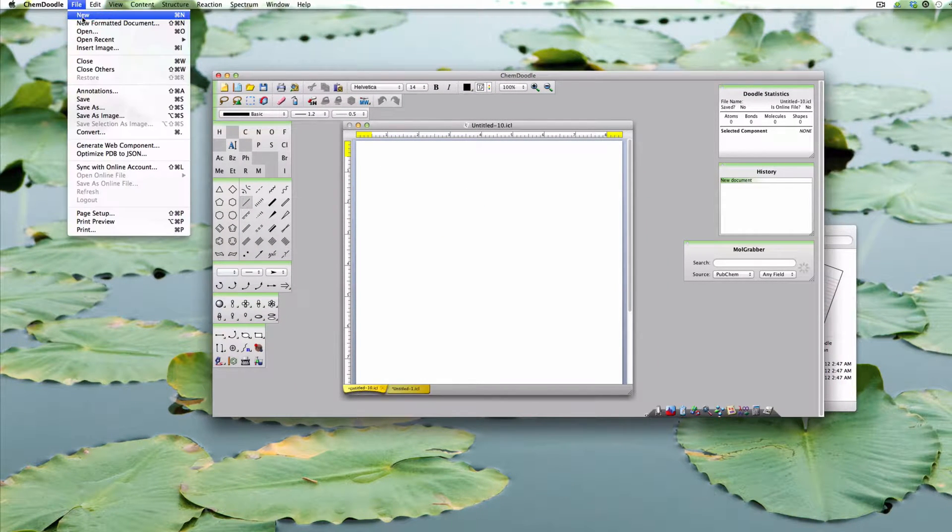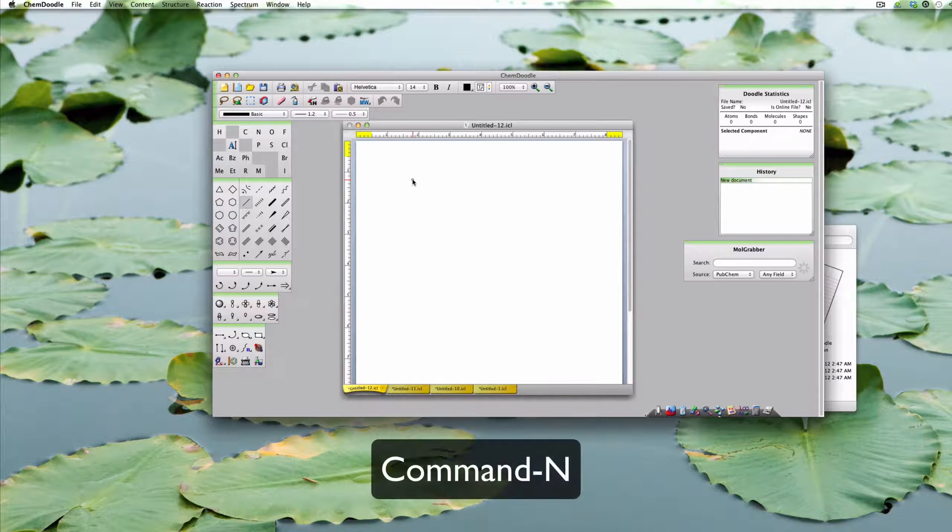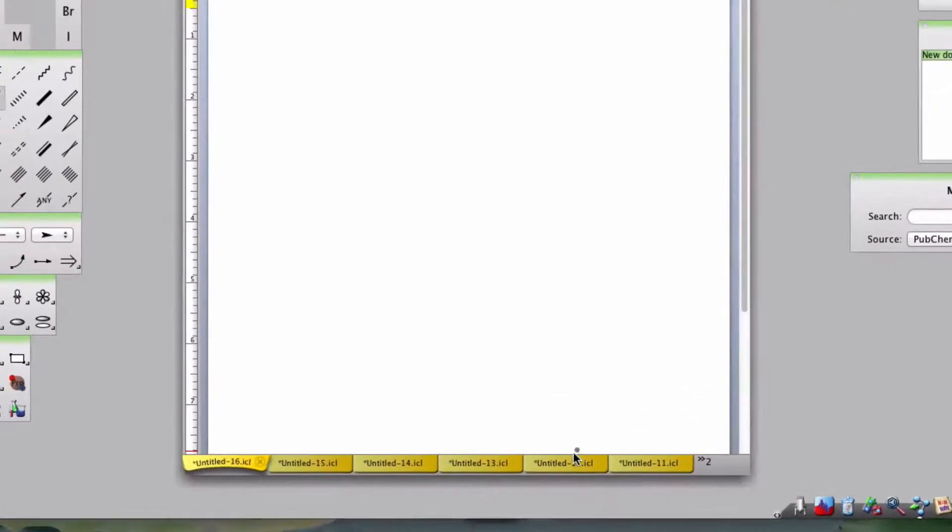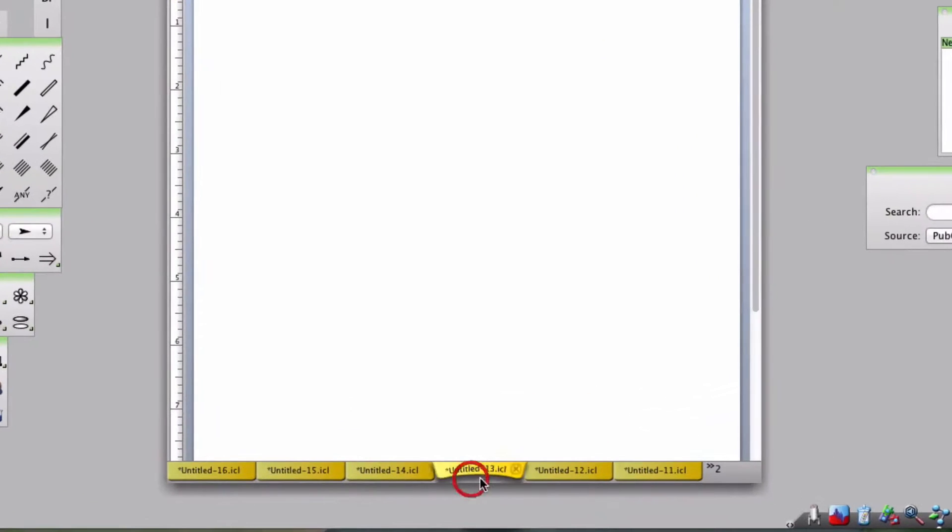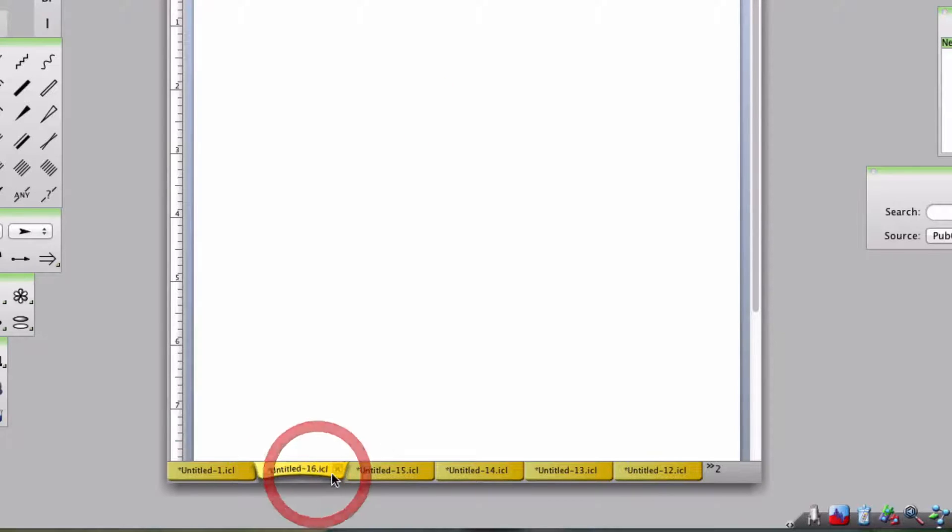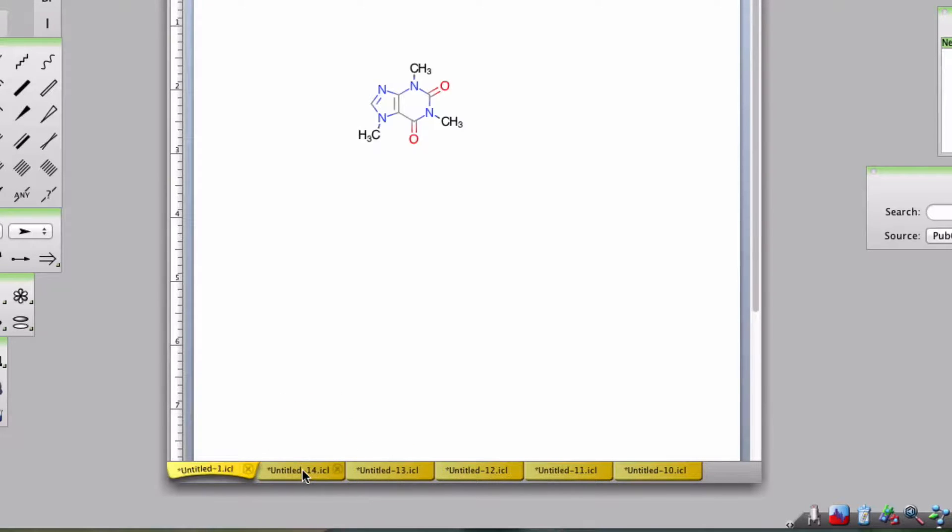You can open as many documents as you want, just click the appropriate tab to switch documents, and if you have too many tabs, you can just browse through them by clicking this icon and selecting the tab. You can close a tab by clicking the X or right click on the tab to access further options.